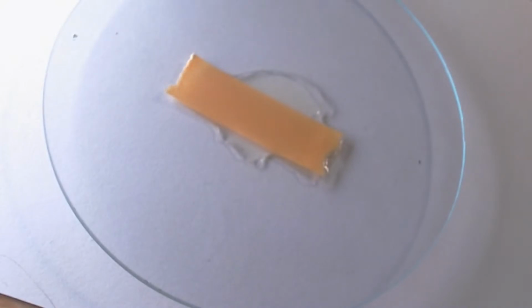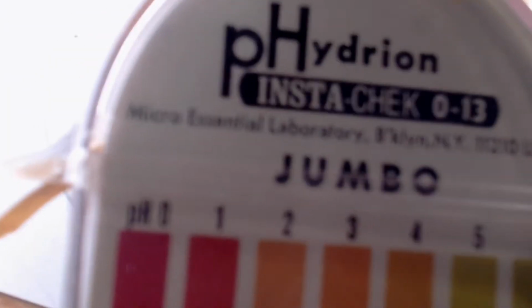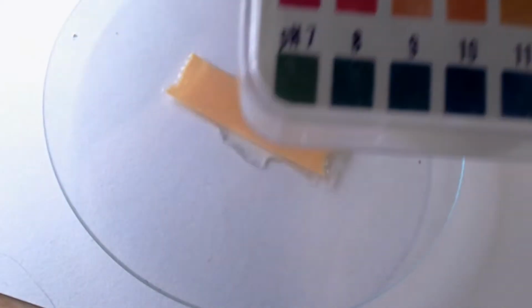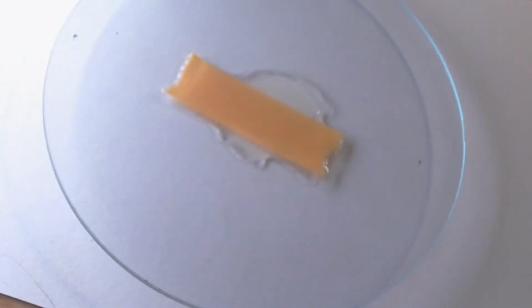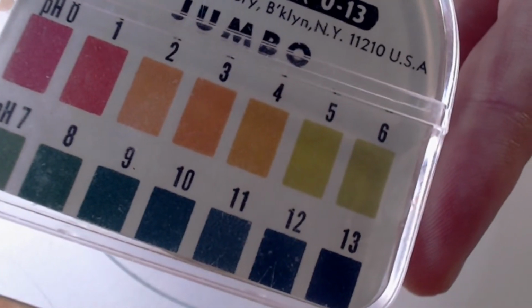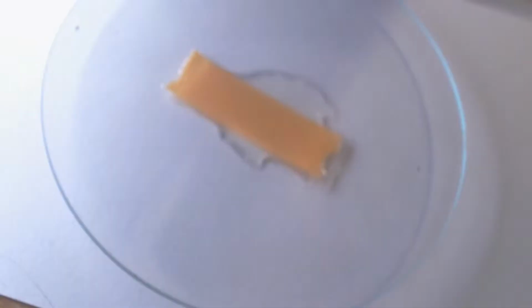So when I look at the scale here, if you look at the scale, you see 3 right there, like Loretta's saying, kind of an orange. And yeah, I think I'd agree with that. Kind of looks the same as our 3 here. There's 3, maybe even a little less towards 2. All right, that's lemon juice.